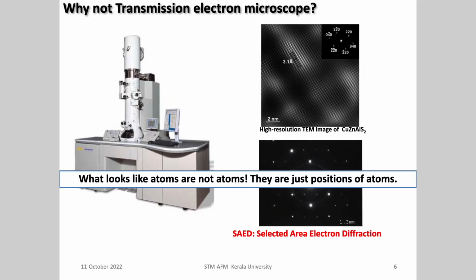So if you just take these 6 points, and all these points together, and then you reconstruct the image back, that's what a transmission electron microscope is doing. It is not giving you atomic resolution. Okay. This diffraction pattern was obtained by this grating, which was a crystal. So you get this one, and you do an inverse transform. You will get this image.